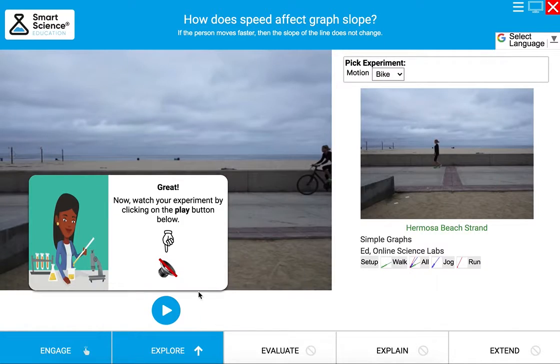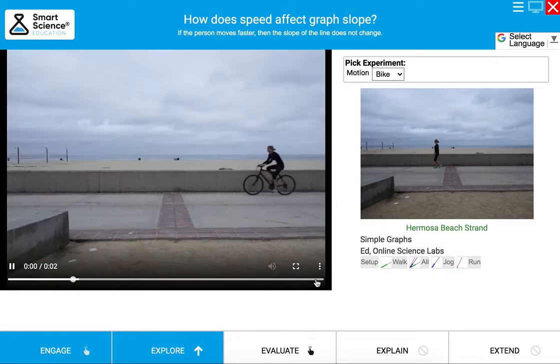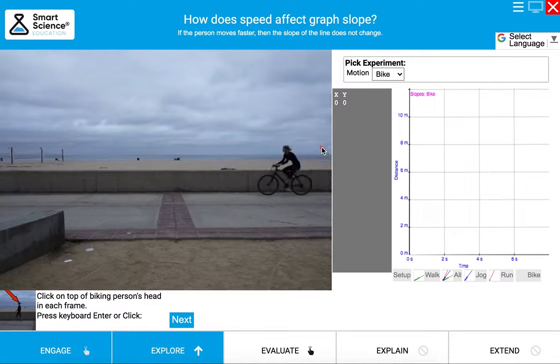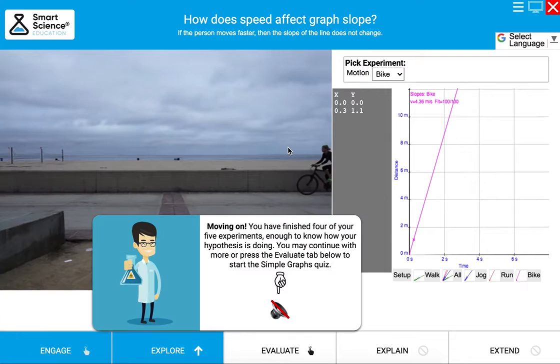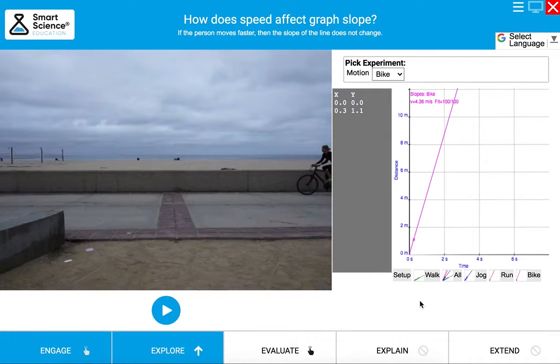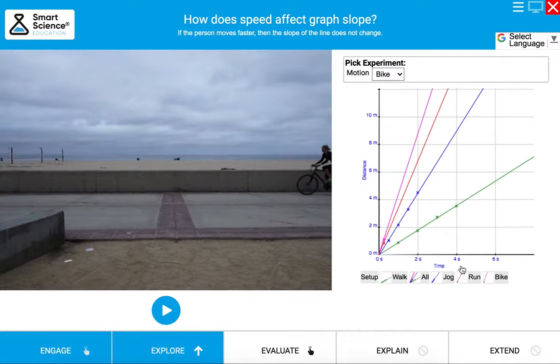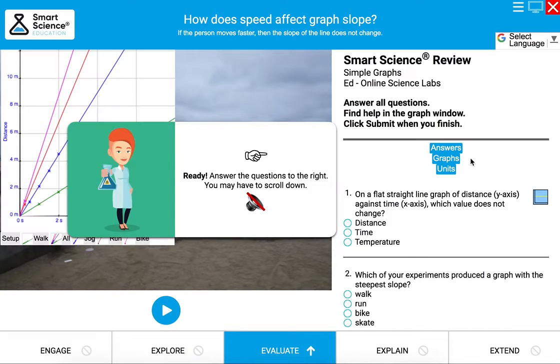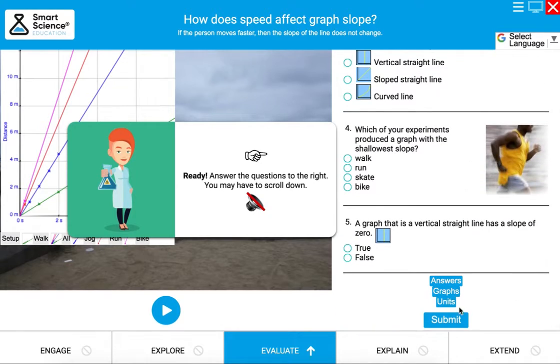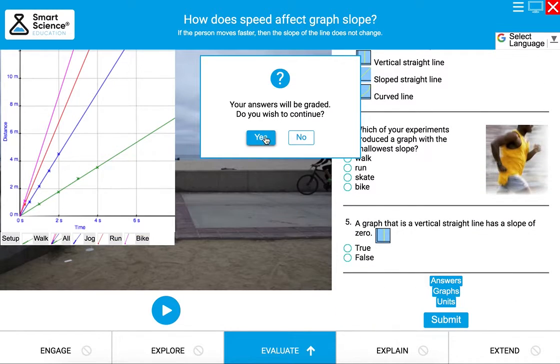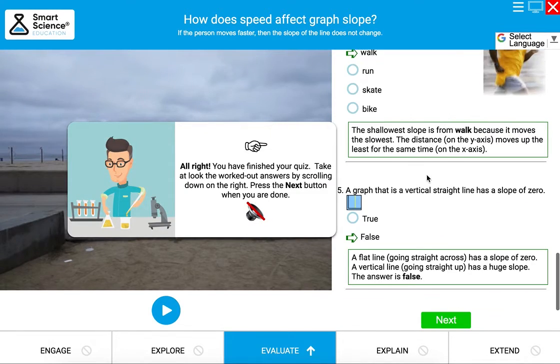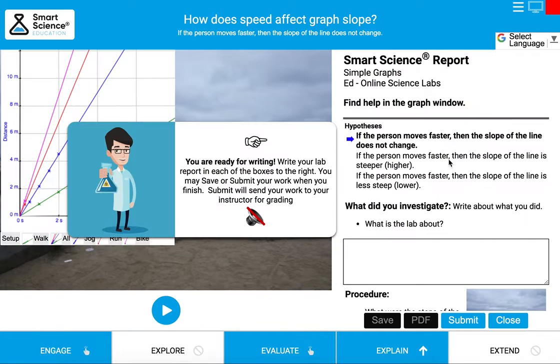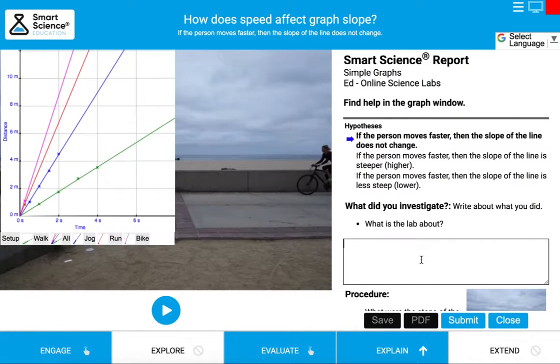Let's do one more video and get to the Evaluate stage. Notice I'm quickly creating my graphs with a few data points and looking at the summary graph. Press Evaluate, answer your post-lab questions, press Submit, check out your results, press Next, then press Explain to write your lab report.